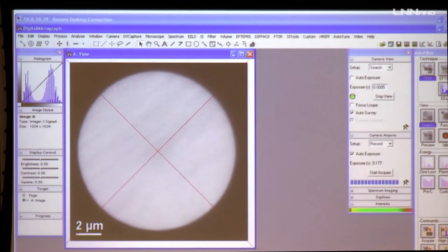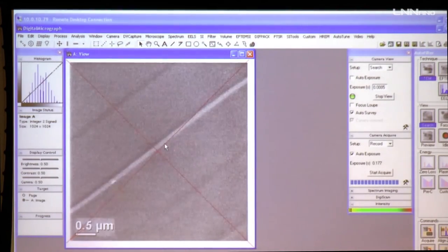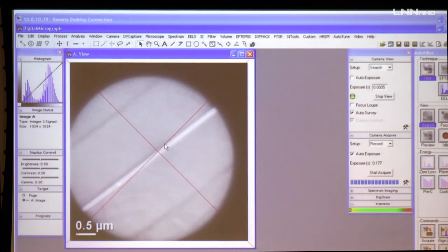That's the sample, and you see this fine line. This is the glue line where I can expect some sort of amorphous region, because glue is an amorphous material. So there I need to perform this alignment. I believe it's a bit hard, but if I can't do this on this sample, in the next session Erico will be working on a good amorphous sample, I mean a nanoparticle sample.